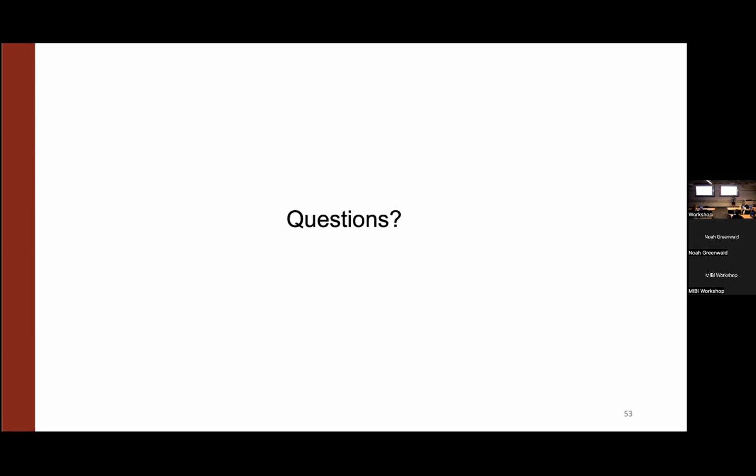Yeah, you can make the choice of what markers you want to include to try to address that. If you think there are like discrete states in the transition, then you can include markers for those transition states in the pixel clustering, and hopefully you'd be able to capture it. Again, it just depends on the question.